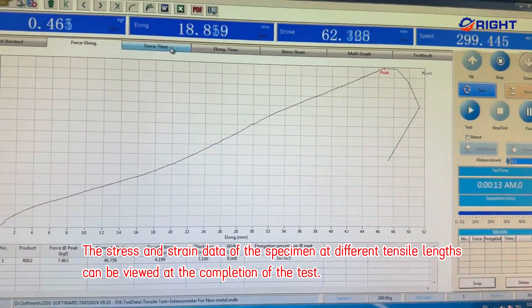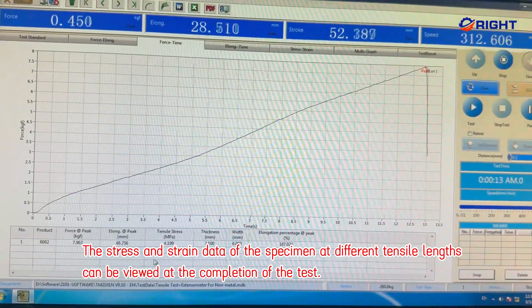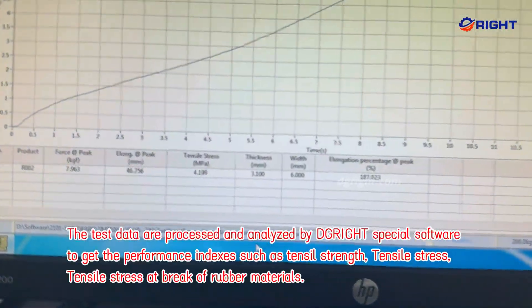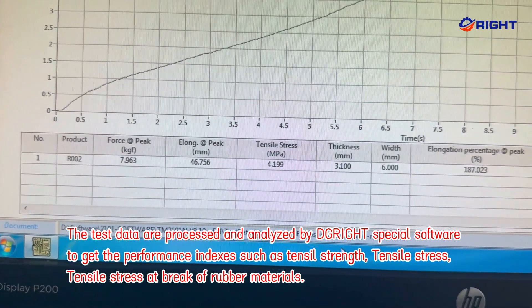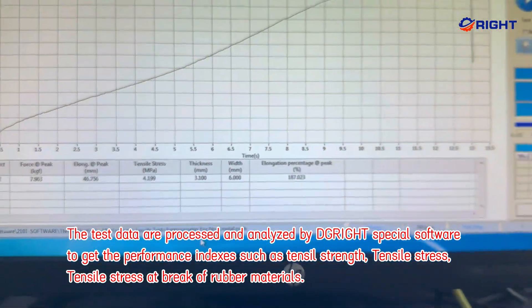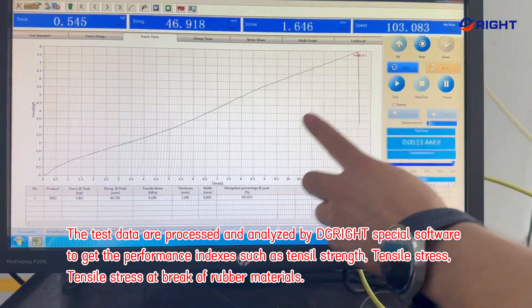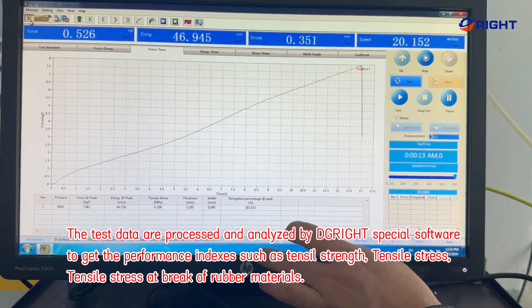The stress and strain data of the specimen at different tensile lengths can be viewed at the completion of the test. The test data are processed and analyzed by specialist software to obtain performance indexes such as tensile strength, tensile stress, and tensile stress at break of rubber materials.